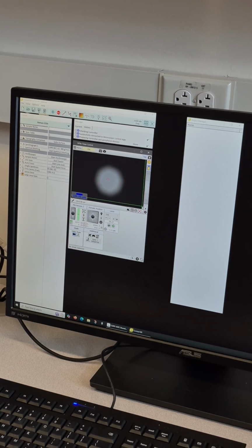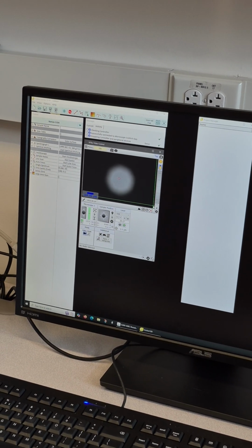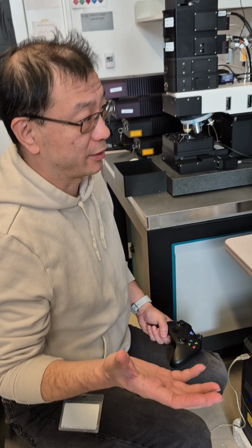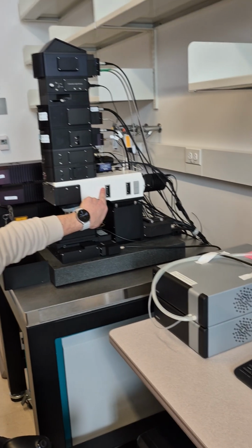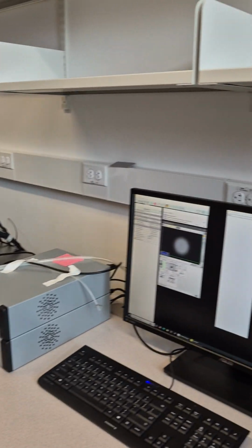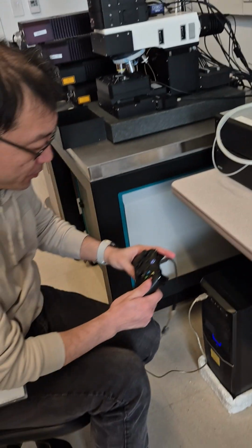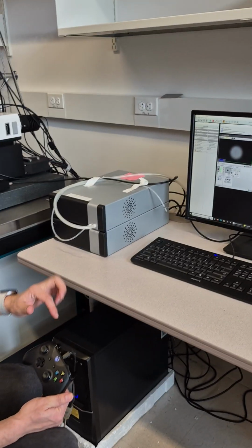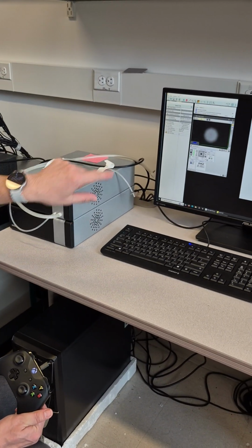Based on your knowledge of your sample, you might know, oh, my sample is very flat, a silicon surface, we don't have much etched feature, so it might be called featureless. So you just insert this aperture. Okay. All you need to do at this stage is move up and down to make the edge of the aperture sharp.